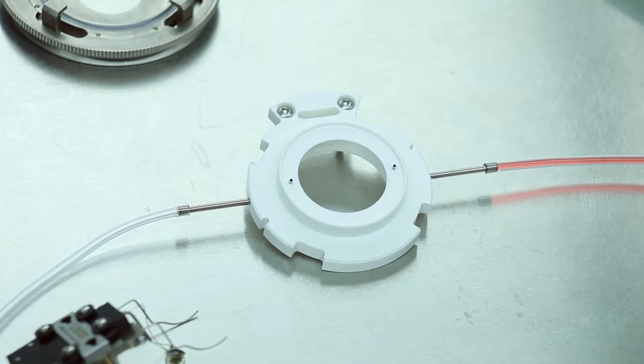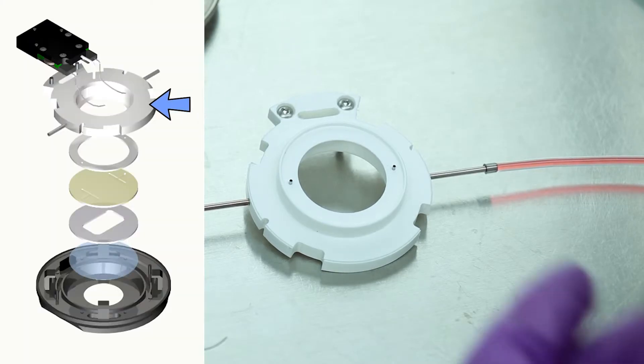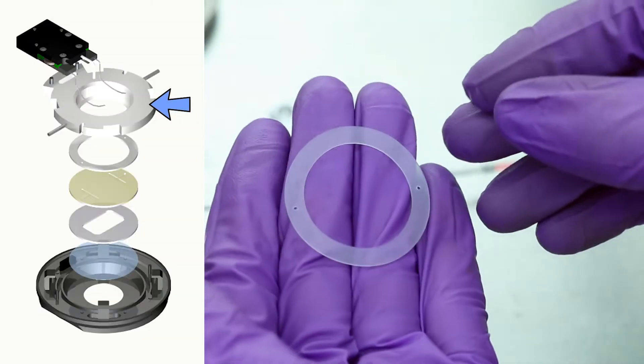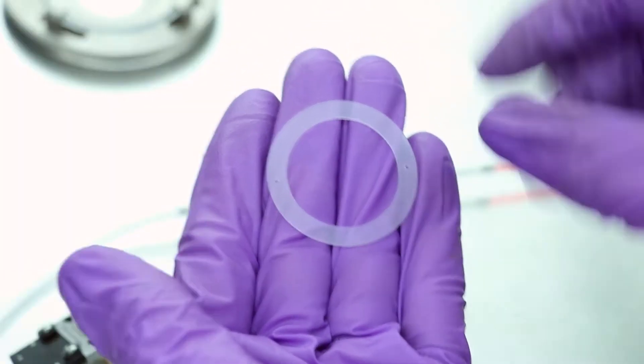To load the FCS2 chamber, first take the white top and place upside down. Next, take the upper perfusion gasket and align the holes over the perfusion ports on the top.